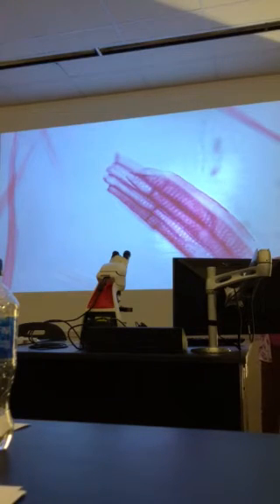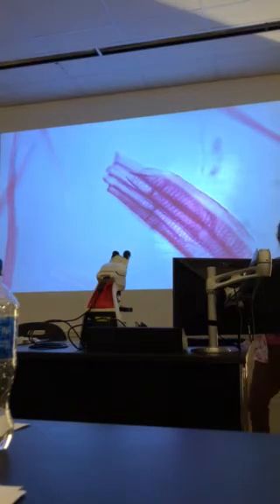Yes? I'm confused because on the document it says Pinus australis tracheus prepared slide, and that's what that looks like. Yeah, this is not, this is Acer rubrum. This is actually Acer rubrum. This is Pinus australis right here.